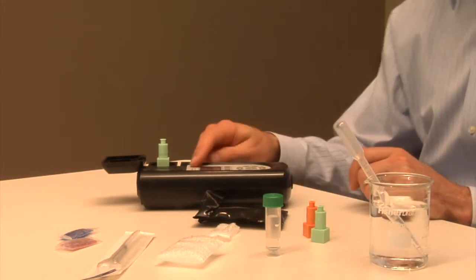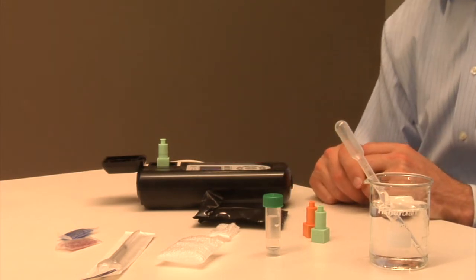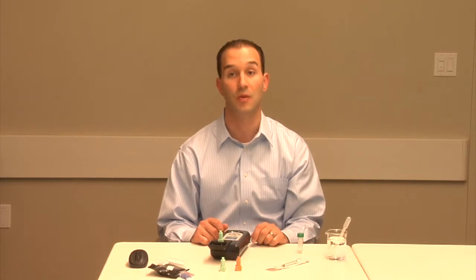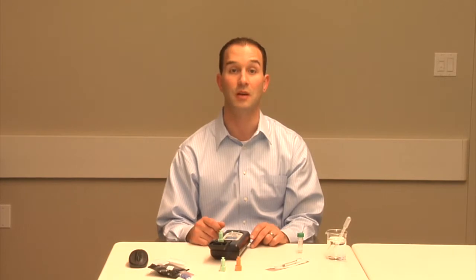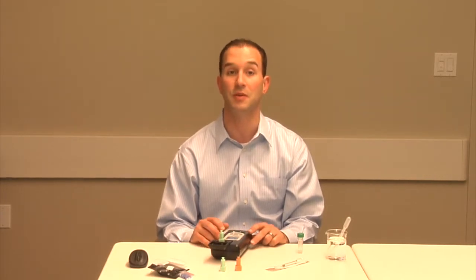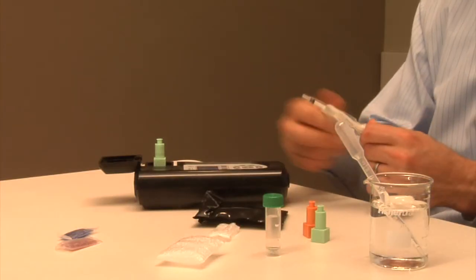Initialize the fluorimeter by pressing the on-off button. Ensure that the fluorimeter is on the correct metal screen. You'll notice the color of the items on the screen will match the color of the sensor. For our test, we have selected lead, and the items are green. Confirm that the site being tested is correct. The fluorimeter should be laid flat on a stable surface during a measurement. With one of the provided syringes, draw 1 milliliter of water from the sample buffer tube into the syringe.